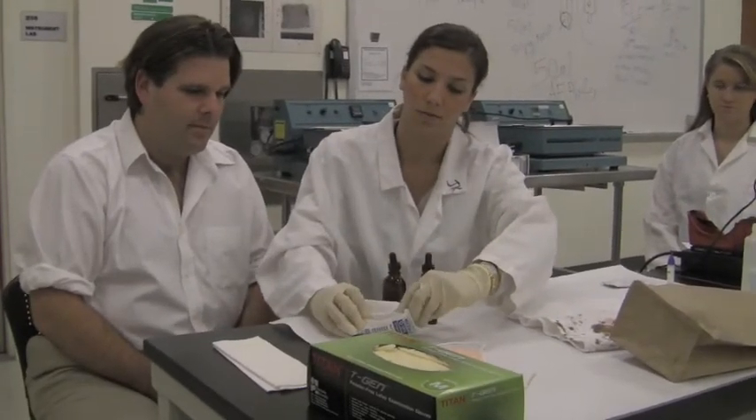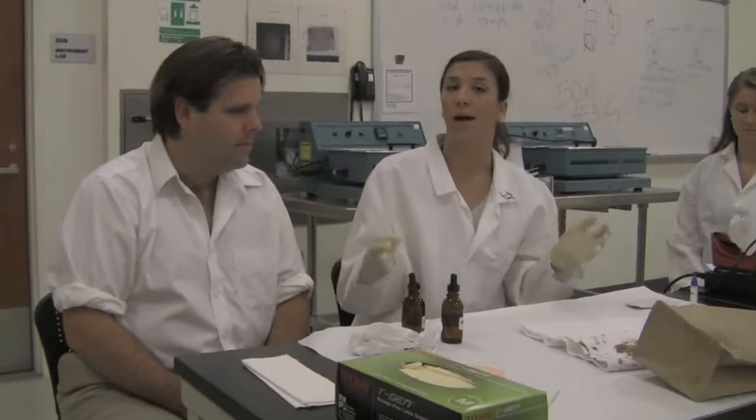Next we would do a positive control, which would be to swab a known source of blood — for example, a cassette of pig's blood. We would swab the known source, run the same test, and because it's a positive control, we expect a positive result. We're going to assume that I did that, and that would mean that our reagents are working properly.